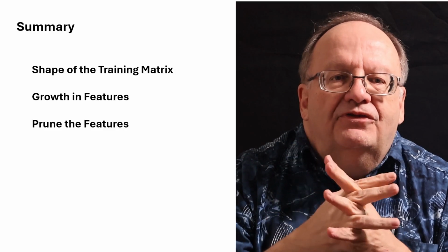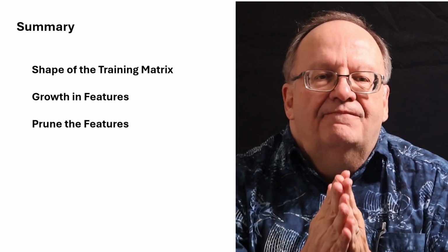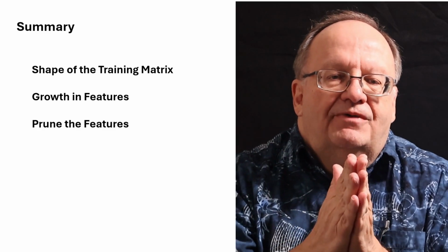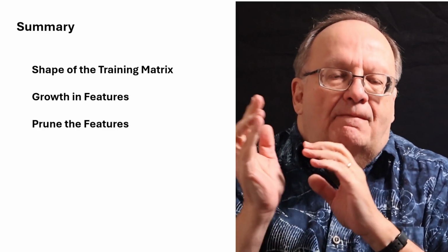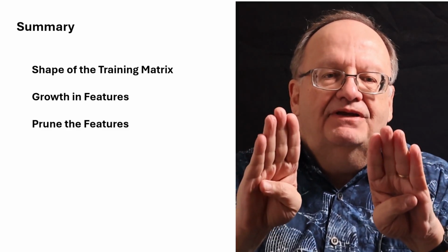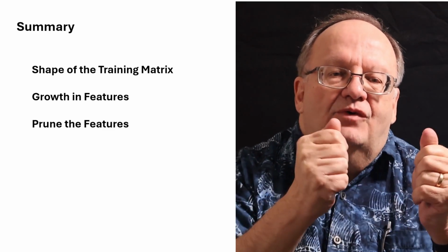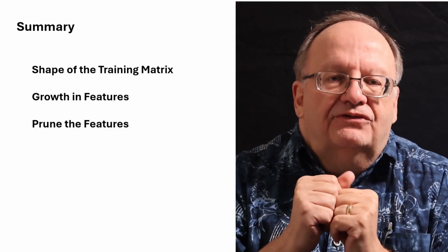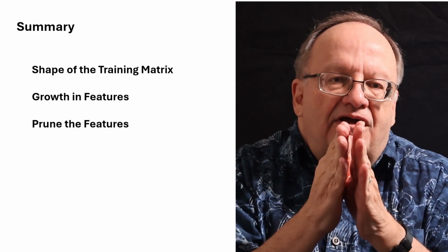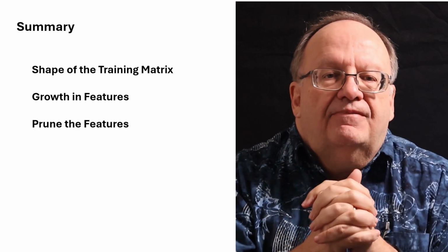Third point, we're going to prune the feature set. The number one way to prune the feature set is decision values. We calculate a decision value for every feature or data point, depending on which terminology you're using. And then we take the biggest decision values, the ones that tell us the most about how to separate A from B, and those are the ones we pass on to our learning algorithm. Those are also the ones we pass on for interesting biochemistry to consider, because remember, each one of these features corresponds to an individual molecule or a small set of molecules depending on the resolution we're using.